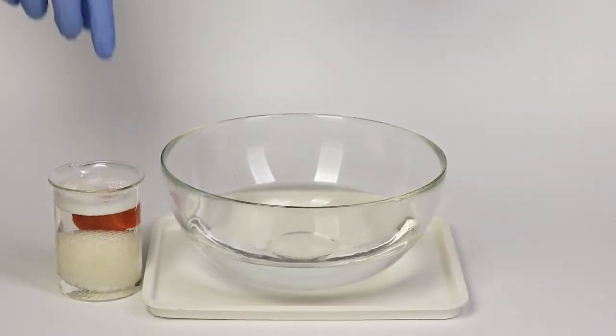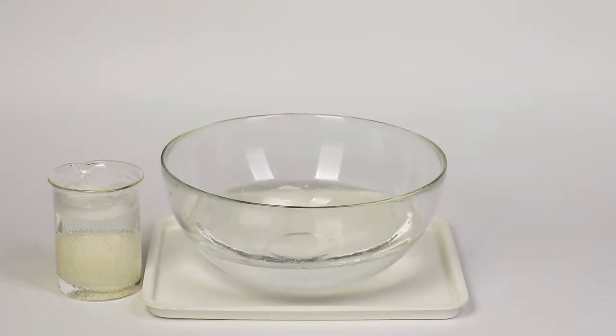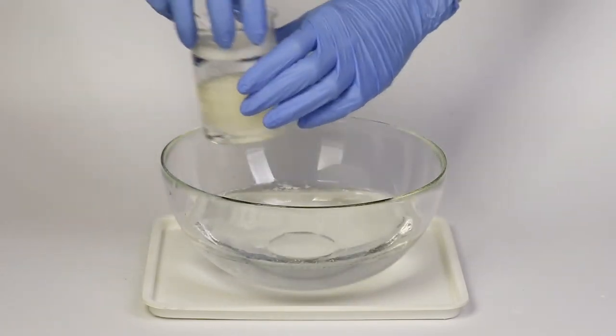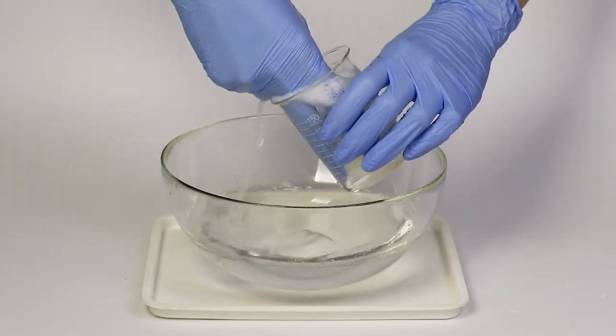Take the stopper out of the beaker and wash it with water. After this, carefully remove the egg from the beaker and gently rinse it with water. Pour the vinegar solution down the sink.